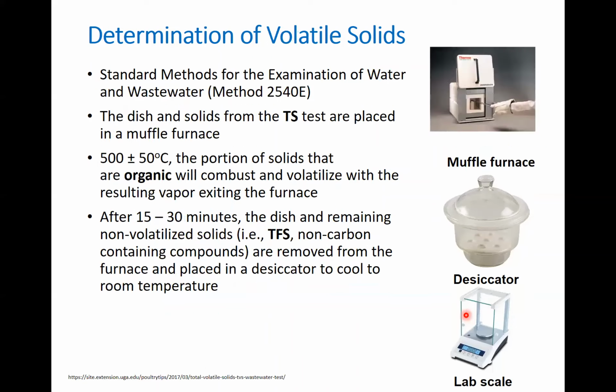Okay, so then we take the material that we just tested and weighed after drying at 103 to 105, and we put it in a muffle furnace for some time.